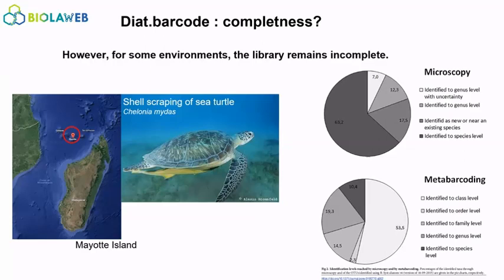It's also the way people count the diatoms in French Guiana under the microscope. It's difficult. They put some boundaries for, for instance, two species which are probably the same species, but with a different cell size reduction moment.